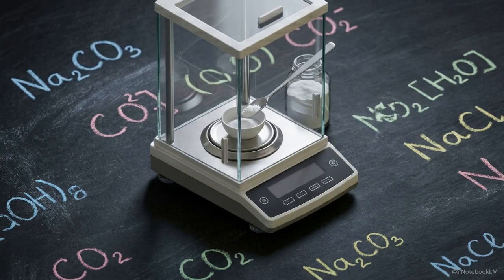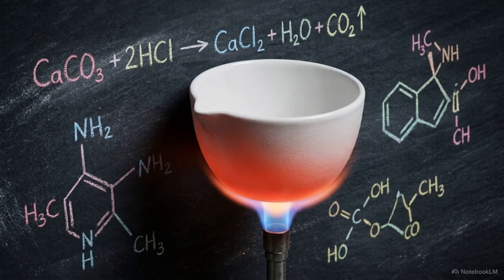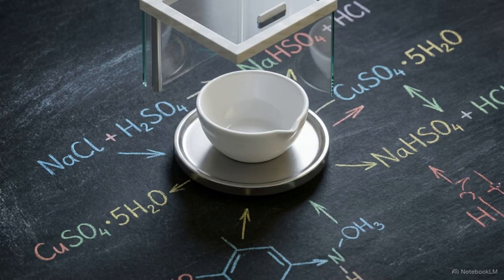Once cooled, weigh out approximately 0.5 to 0.6 grams of the solid sodium carbonate into the crucible. Record this exact starting mass in your notebook down to the milligram. Establishing a completely dry, structurally sound, and accurately weighed baseline guarantees that our final numbers will reflect actual chemical yield, rather than water weight or equipment failure.